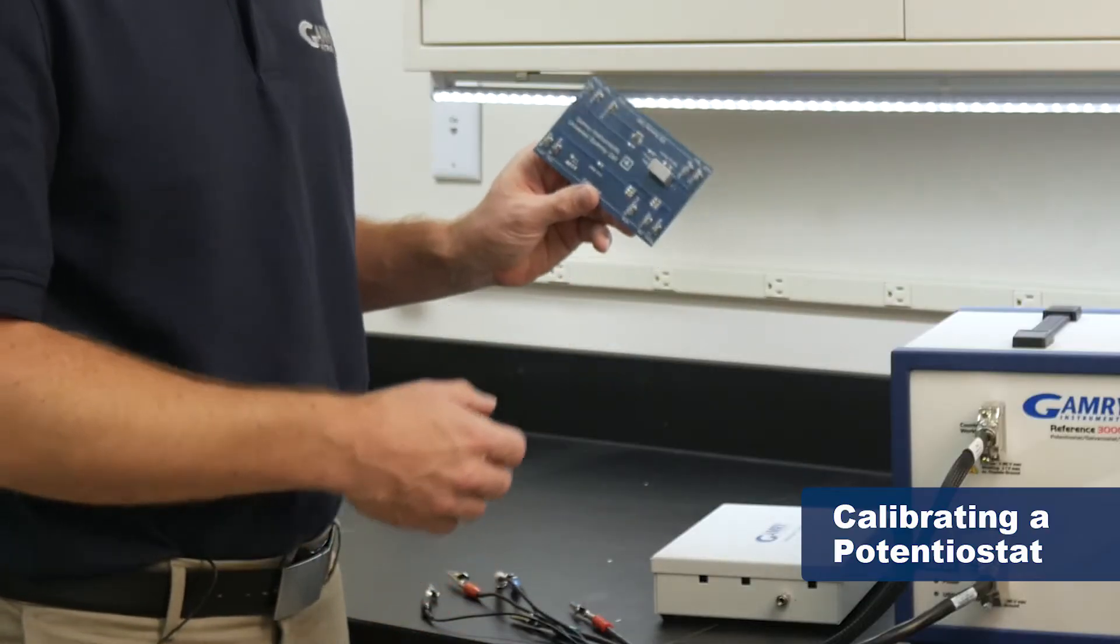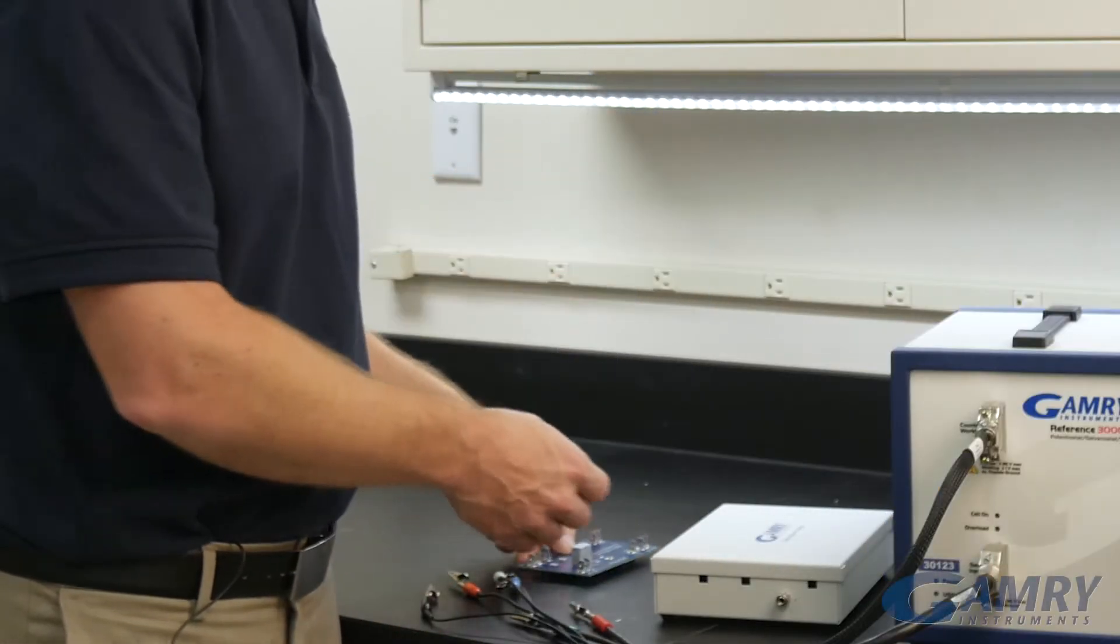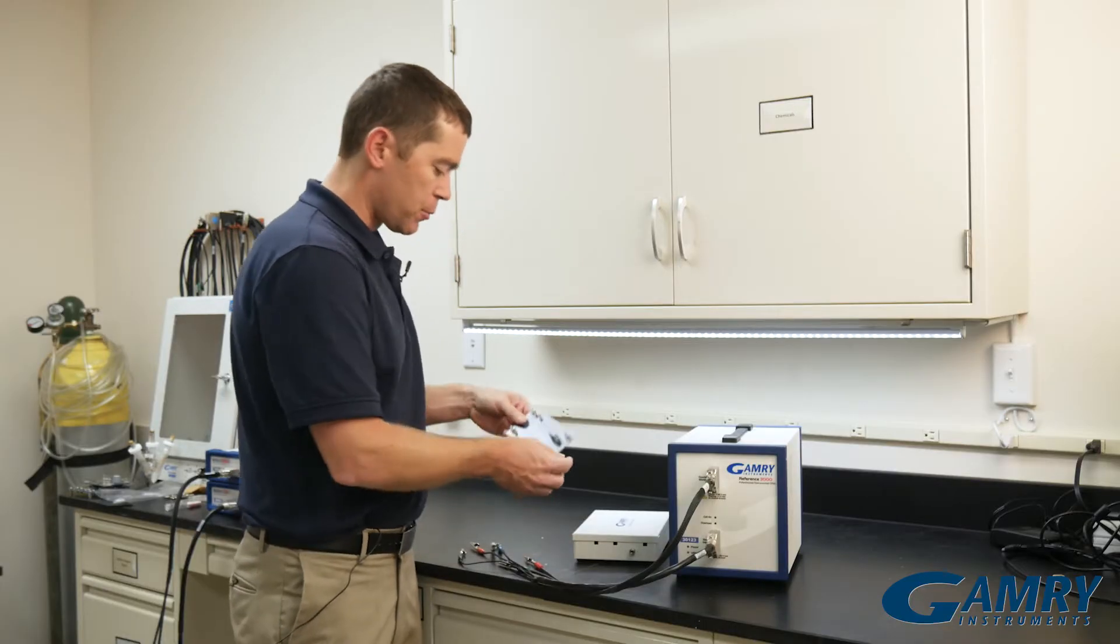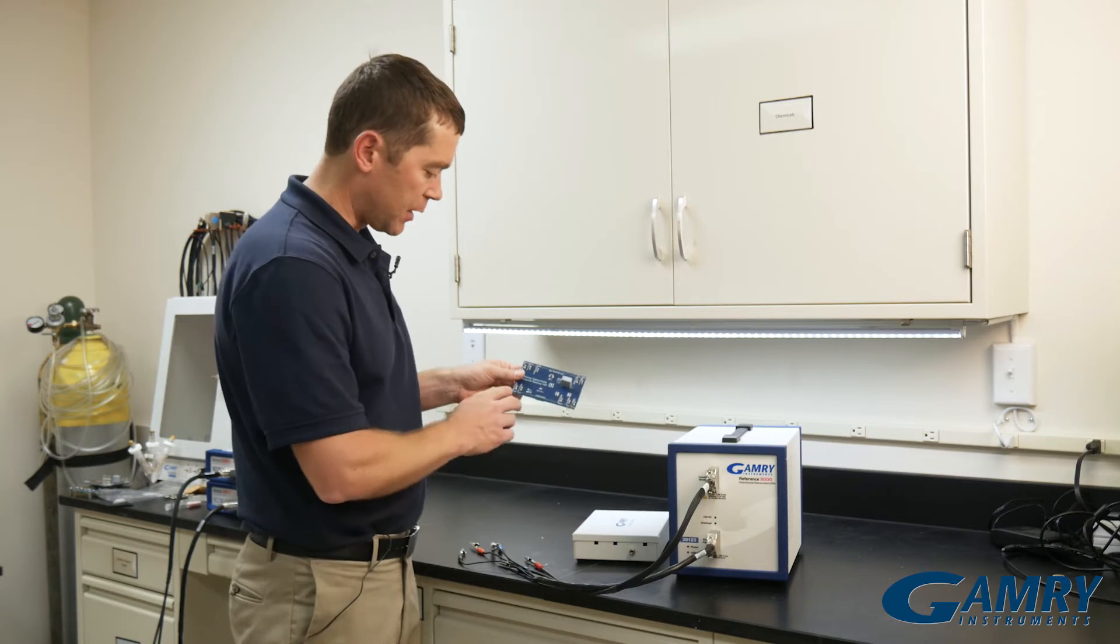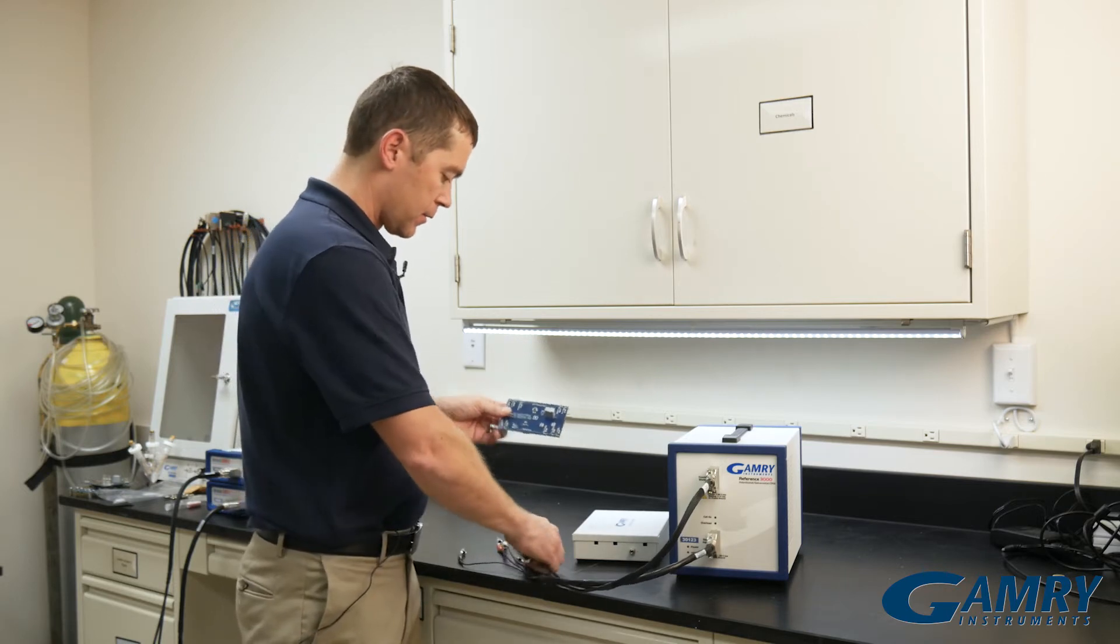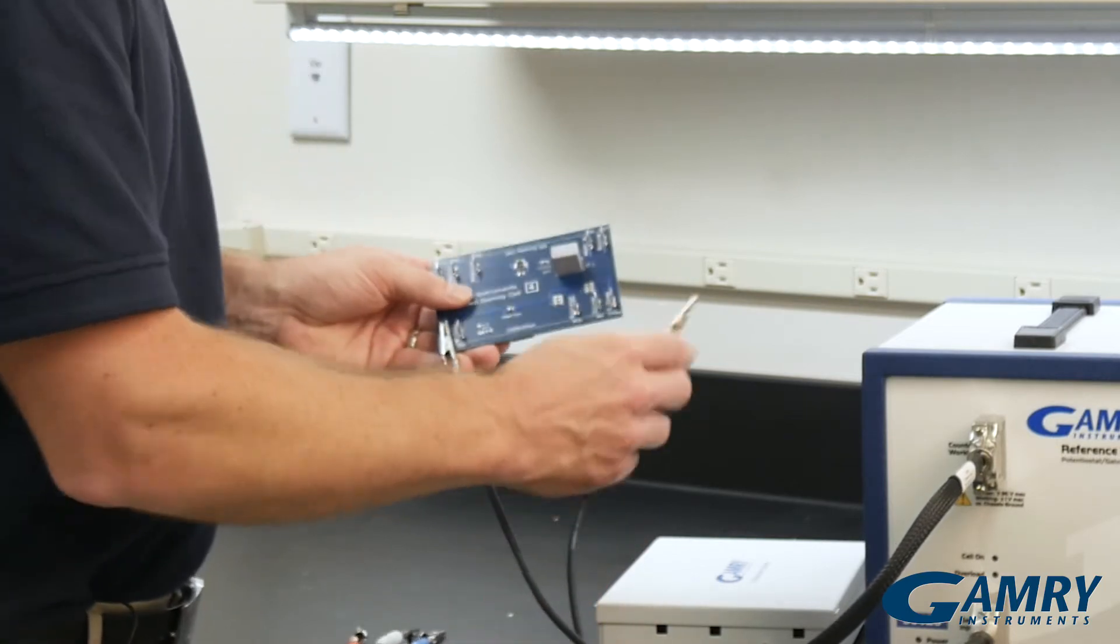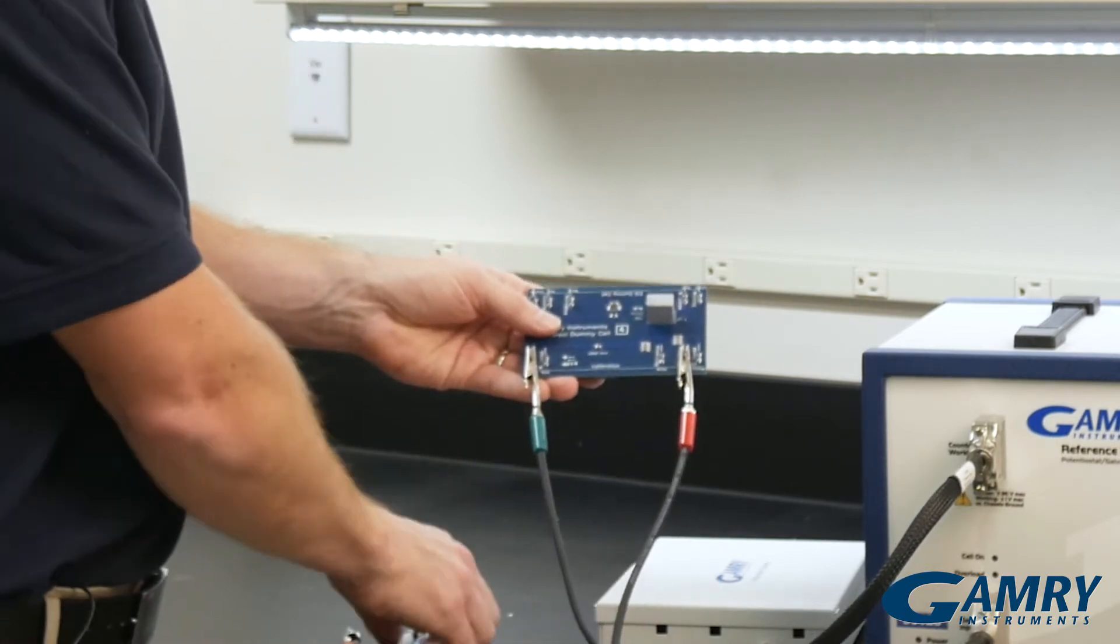All of our potentiostats come with a calibration board and a calibration shield. The calibration board tells you how to make the connections and labels them by color. So we take our cell leads and connect them up to the correct color.